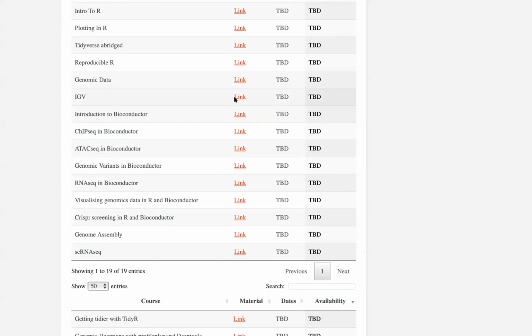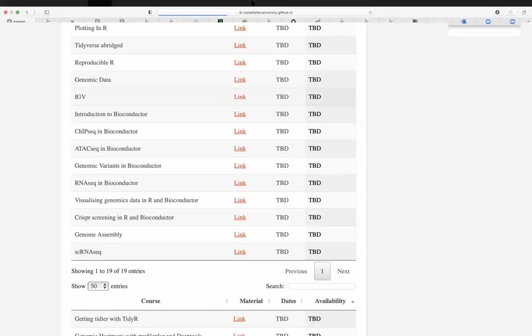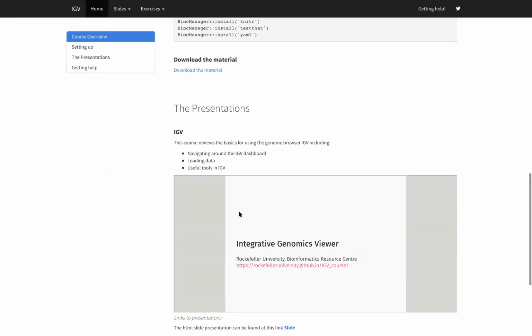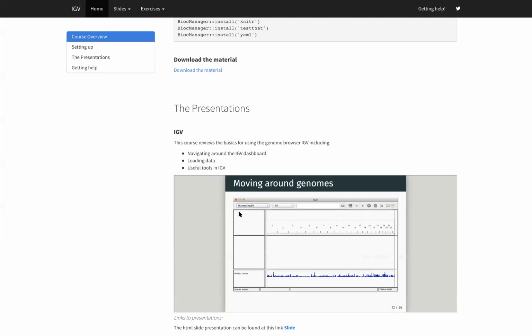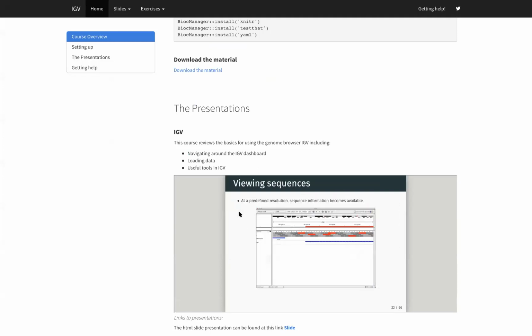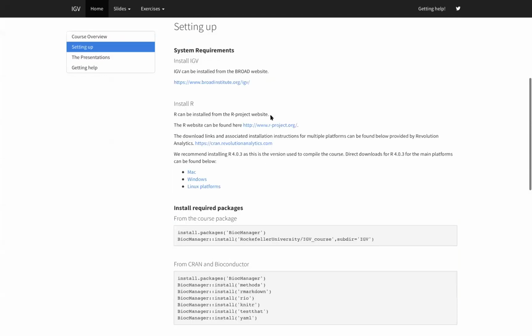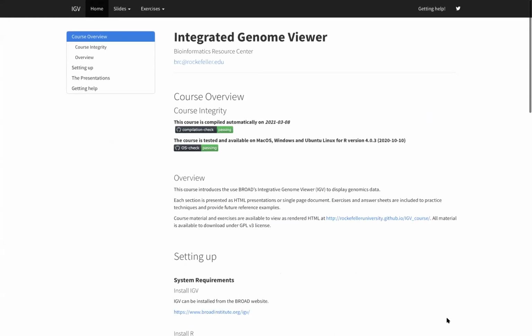So this will be, again, no programming today. But this is a nice tool which just allows us to navigate data in a genome browser, in a nice linear genome. And we're hopefully going to be able to start to use it with public data. So we can start to take other people's data, maybe your own lab's data from previous publications, and review it inside IGV. Okay, so there's no exercise.